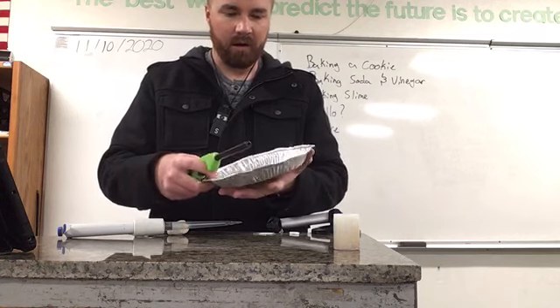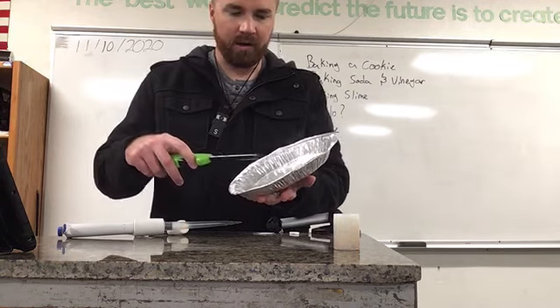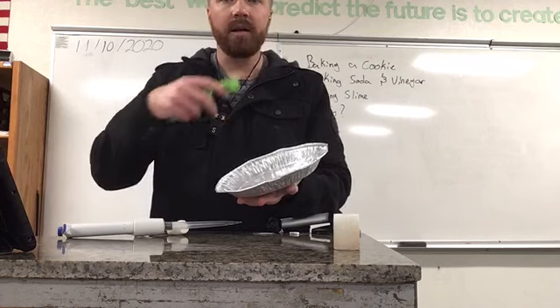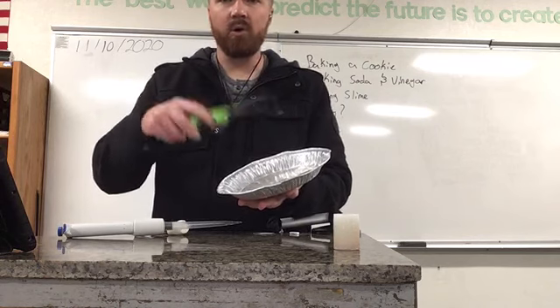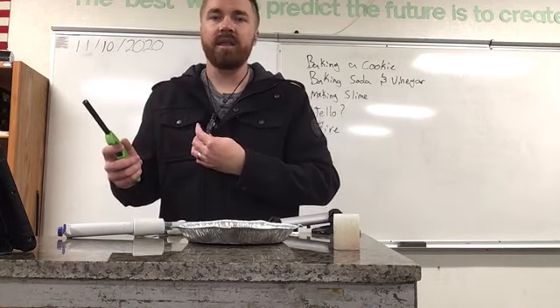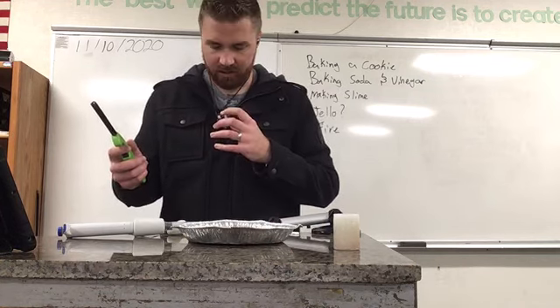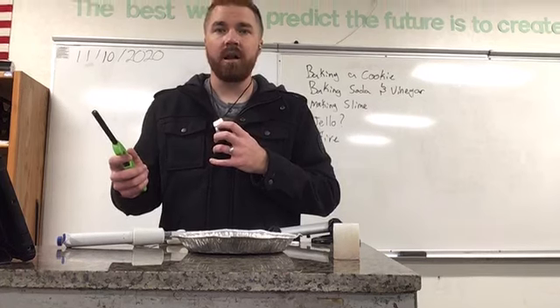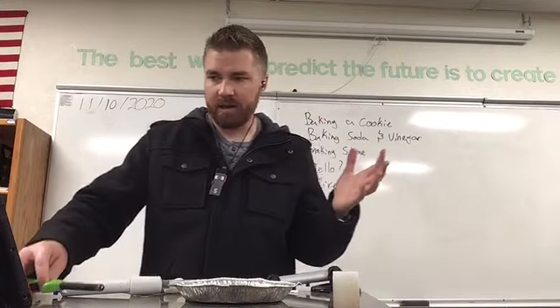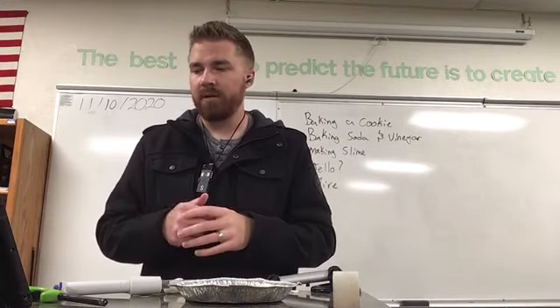And then, though not all of it burnt, that's okay. Don't need it all to be able to see the properties that are going on there. And realize that the smoke is also one of the products from this reaction, and that it should be considered with the experiment as some of the final products.